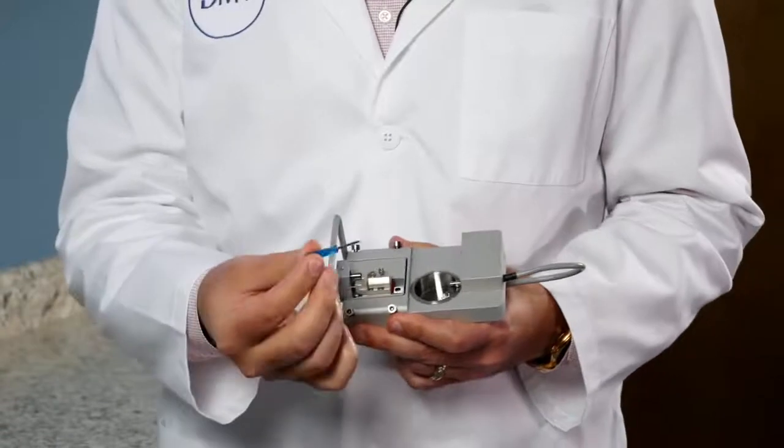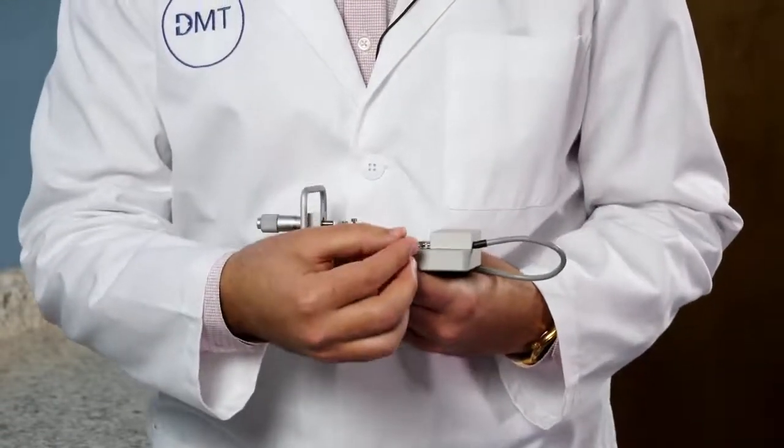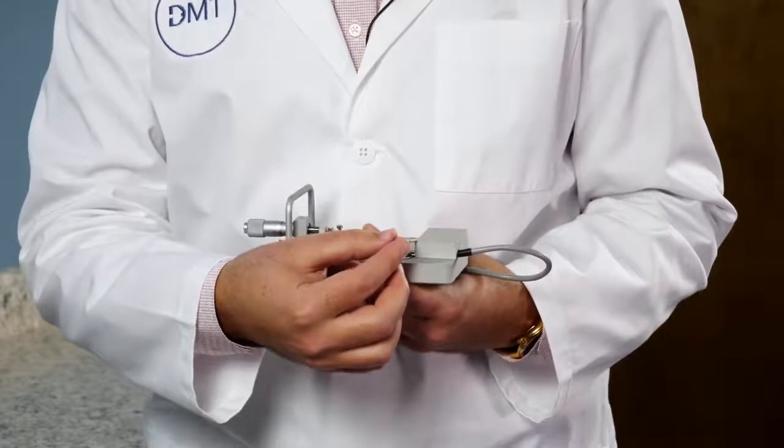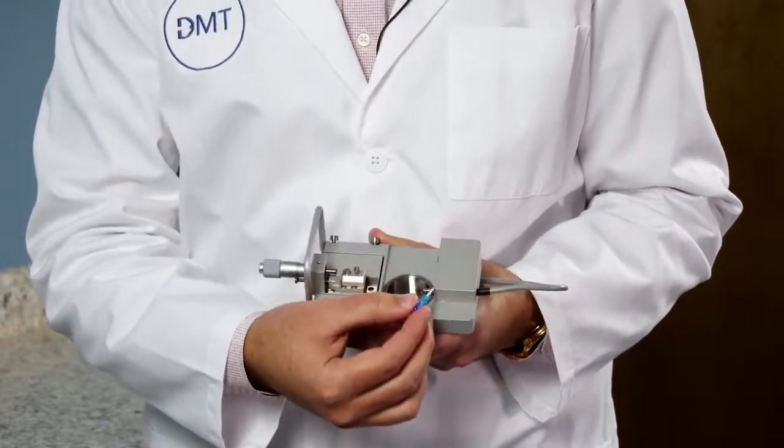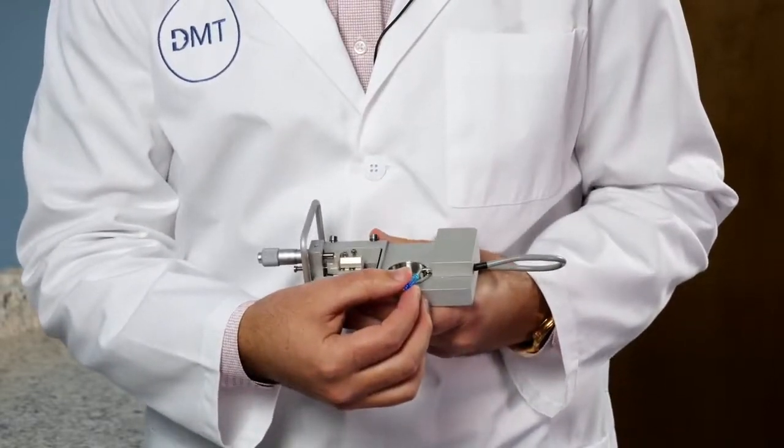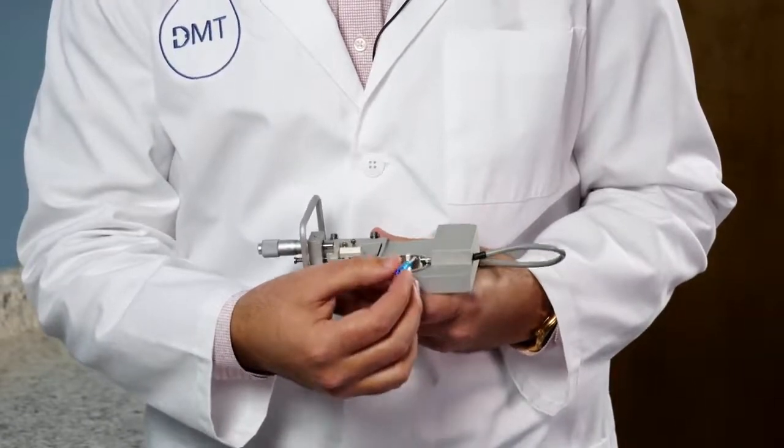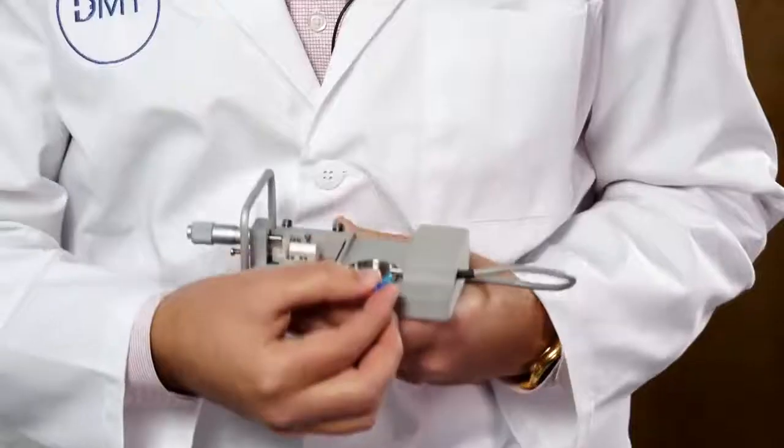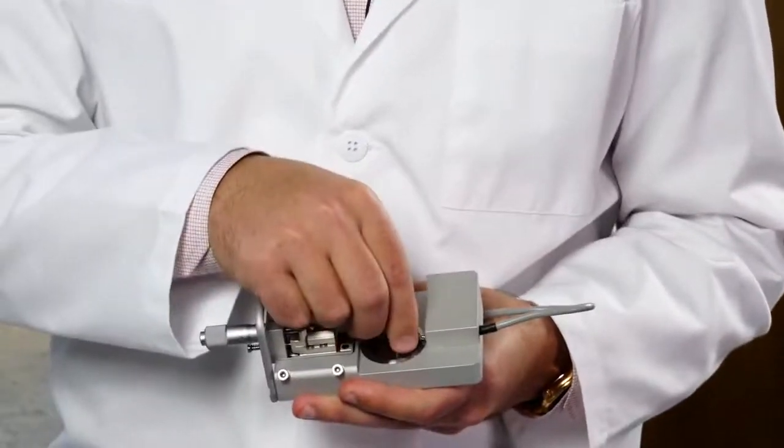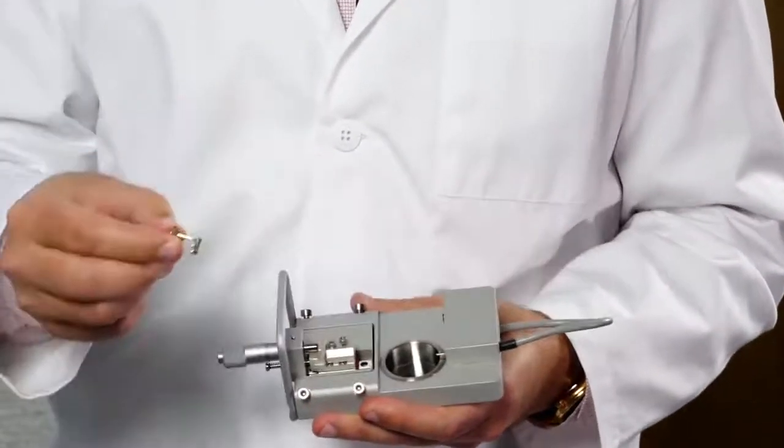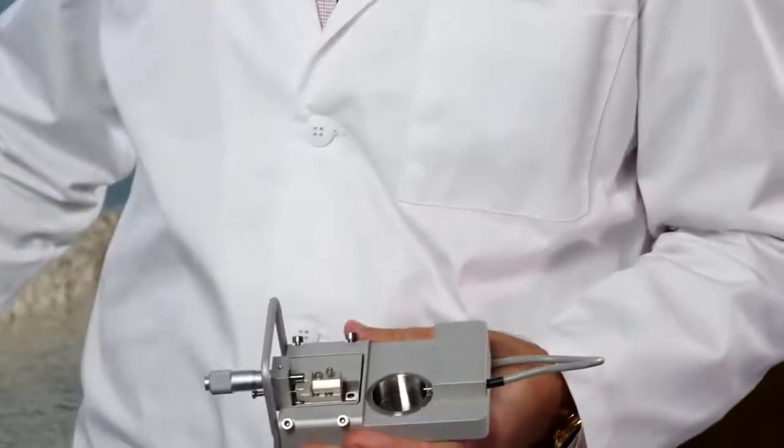Then you will need to take your small screwdriver and loosen the back screw that's closest to the force transducer. Now you'll need to be careful when doing this as you do not want to put extra pressure on the transducer itself. And then you can slide this jaw off the transducer arm and set that aside.